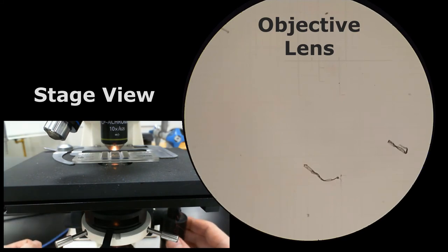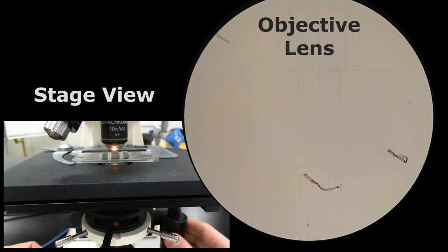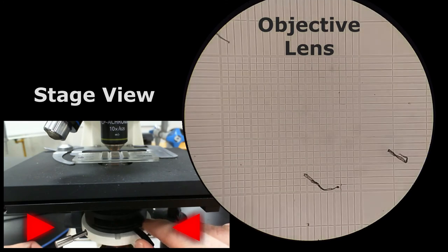By the way, those things that you can see there are fibers from the paper towel. This is why you want to clean with a Kim wipe more than a paper towel, because the paper towel will leave behind these little fibers. When you have one of these chambers that I'm using right now, what you want to do is increase your contrast. You do that by using this adjustment slider here. This closes the condenser iris diaphragm, and by doing that, you increase the contrast on your slide.